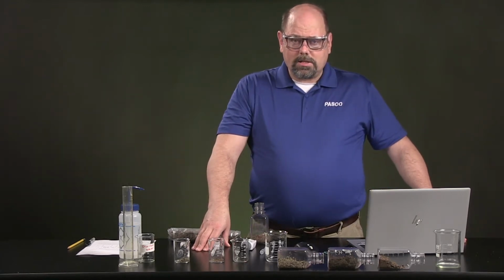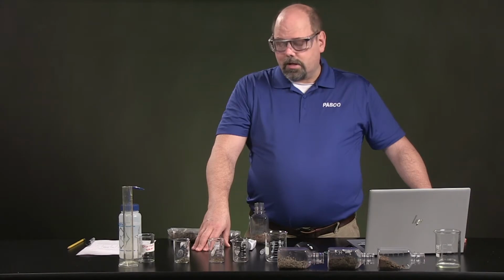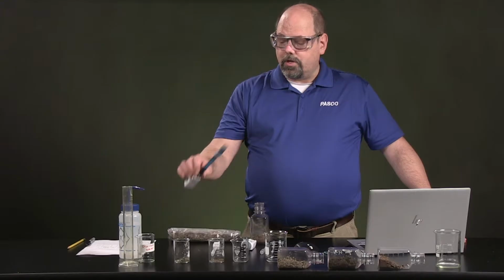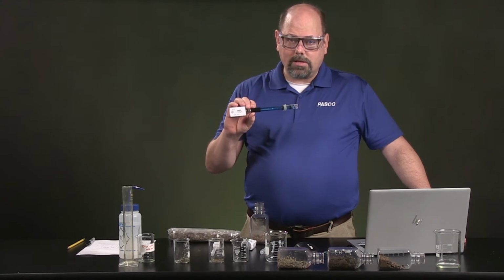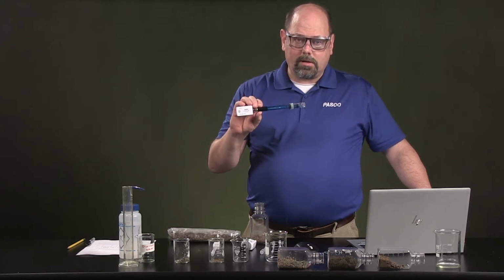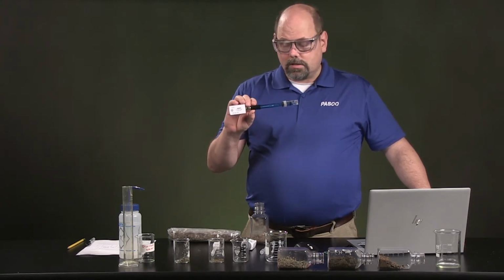So we're going to have the chance to see the salts, the ionic compounds that are in there and that are dissolving. Finally, we'll finish off by taking a look at the pH of the materials and determine sort of the quality of the life in there that's involved.